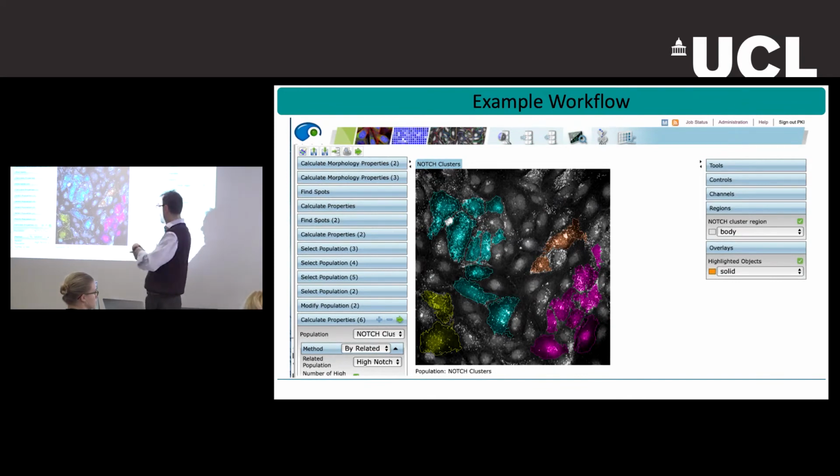As Davide explained, we said that a cell with certain characteristics is called cell type A, or type B, or type C, and then we ask the software to tell us if there are some cell type A that are clustered together, and we find this kind of map, which is interesting. In the case of Notch, it's very interesting biologically for endothelial cells, because it's been reported that Notch in a monolayer is not simply active or non-active, but is quite heterogeneously activated, and apparently in certain conditions it clusters, in certain other conditions it doesn't, and we are trying to figure out what it means biologically.